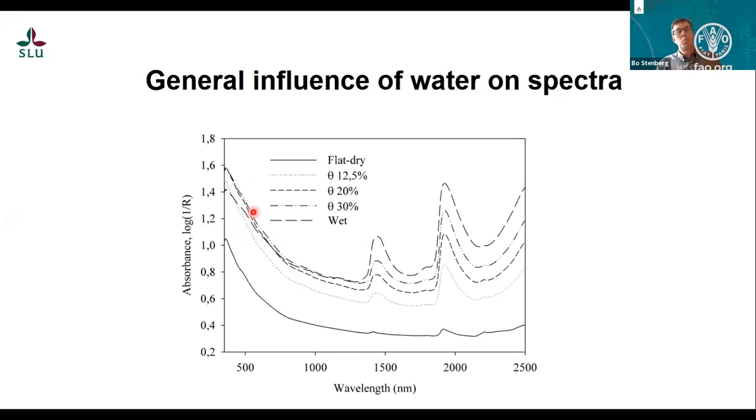It has to do with, as I understand it, the difference in refractive index, because the difference in refractive index between air and soil is high. That means that the light is reflected with a small angle and lots of it is reflected back and hits the detector, while the difference in refractive index between water and soil is low. They are more similar, or you can say both are kind of dark. Then the angle is wider, more open, and the energy or light will just penetrate. You can compare that with a window and a mirror. In a window, the difference in refractive index between air and the glass is small, and you can see right through it. And the opposite with a mirror. So it's kind of the same thing here. That's my picture of it anyway.